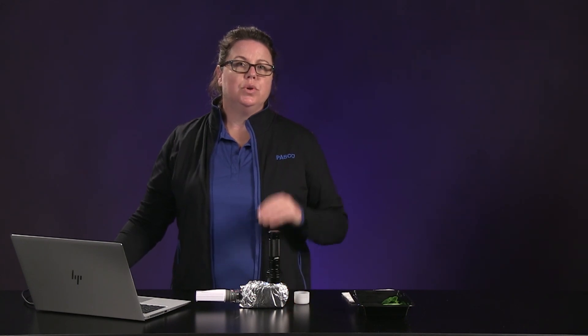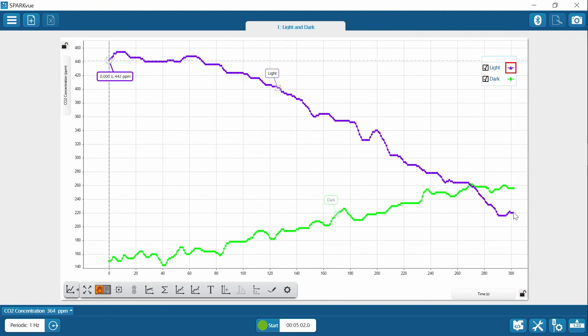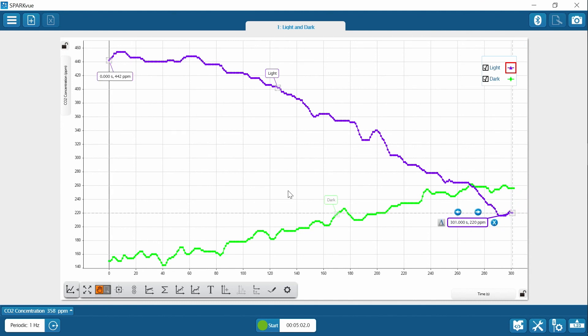During data collection, you were asked to identify the starting and ending CO2 concentration points. To do this, utilize the coordinate tool within SparkView. Click on the starting point of the first run — the light run — and the coordinate tool will tell you the starting concentration, for example 442 parts per million. Then do the same at the end of the run to pull the final value, for example 220. Review the introduction part of the video as well as your data to answer the questions in your student handout.